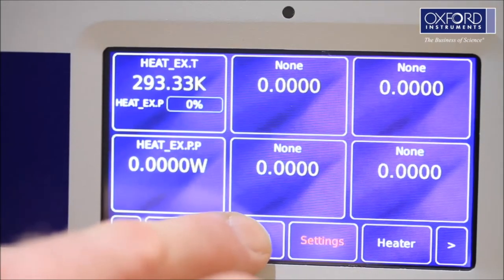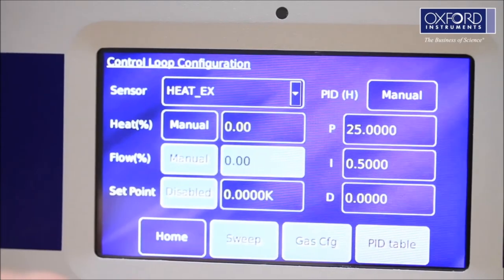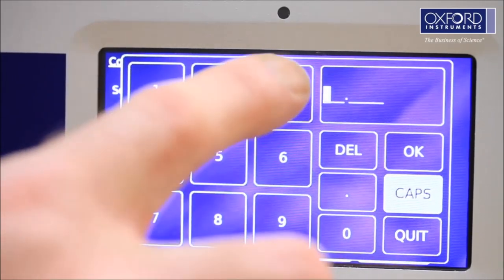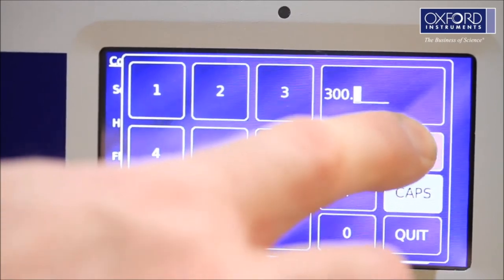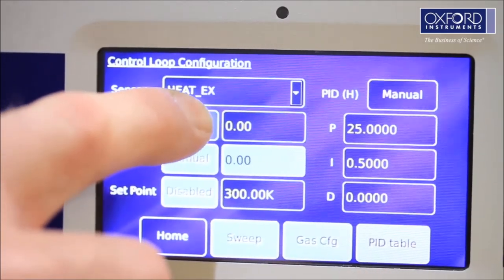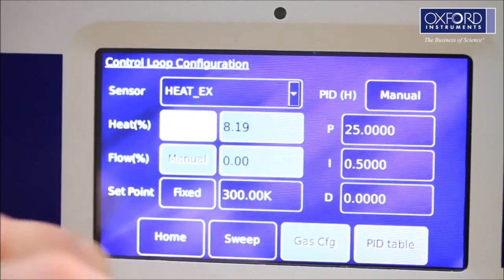While the cryostat is pumping down, change the setpoint on the Mercury ITC to 300 Kelvin and select Auto mode. The cryostat will now control at 300 Kelvin. This will help improve the vacuum while the system is being pumped.